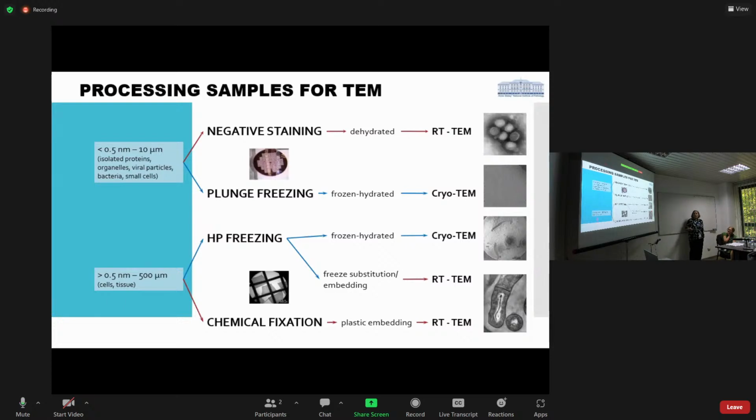Transmission electron microscopy is the best way to look for viruses mostly, and bacteria of course. And we have available some techniques, from the classical plastic embedding procedure, which is quite laborious and time consuming if we need to look for infectious agents in tissues or cells, to the quite easy to do negative staining technique, where the particles will be bright on the dark background and easy to recognize.